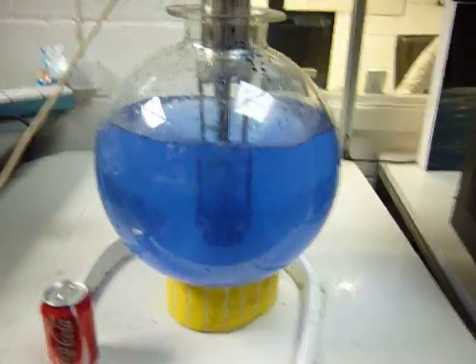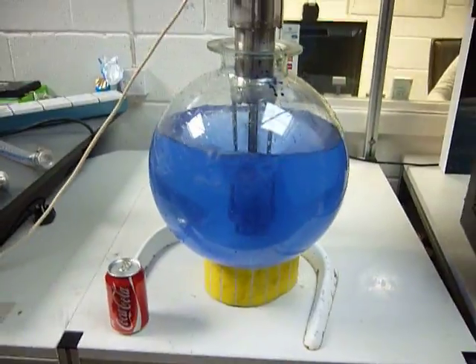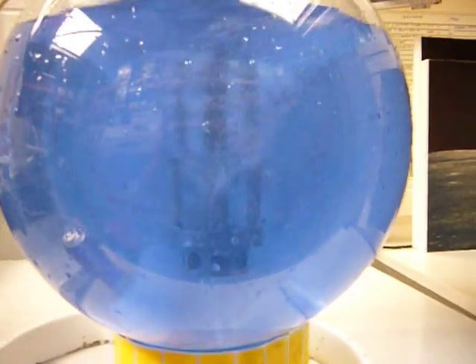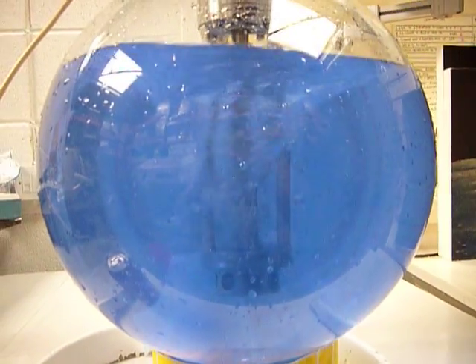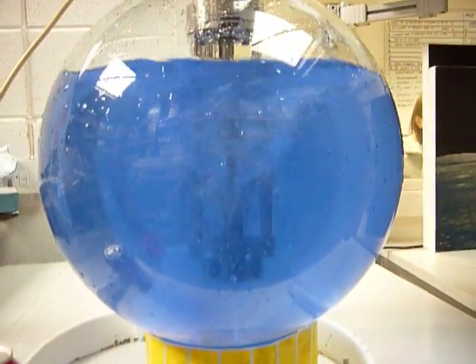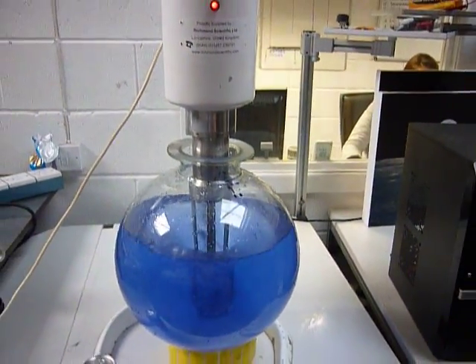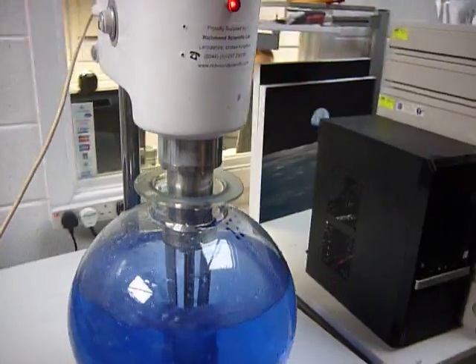So this is a 20 litre flask, ideal for mixing materials, liquid based polymers, pigments, paints etc. And a standard piece of kit within the chemical industry here in the UK and being overseas. Hopefully that gives you some sort of an idea of the capabilities of this machine.